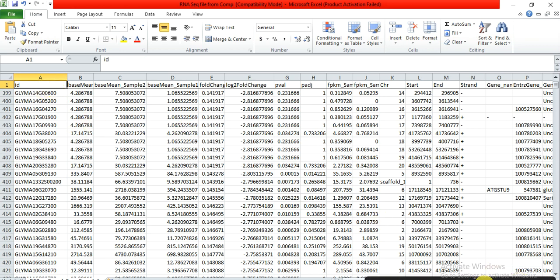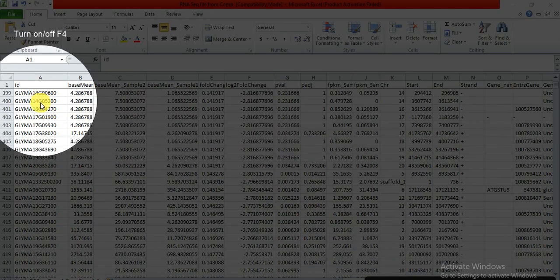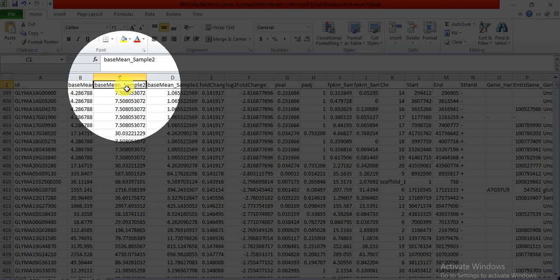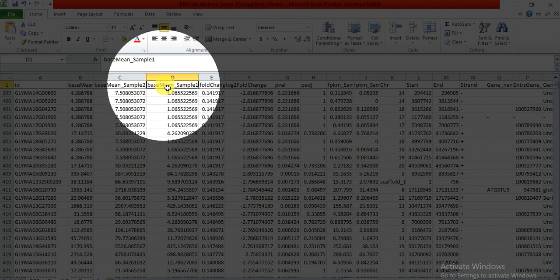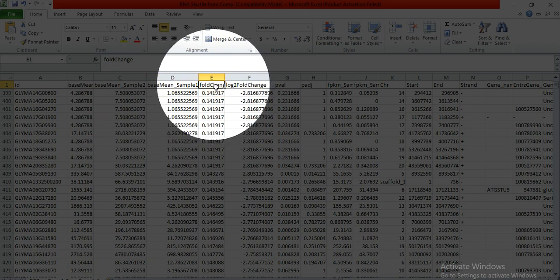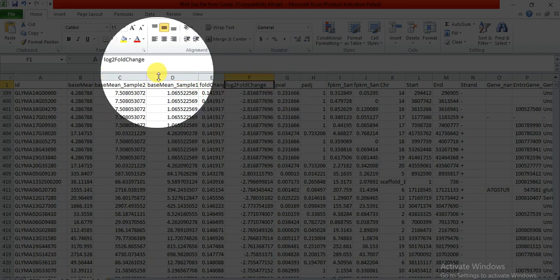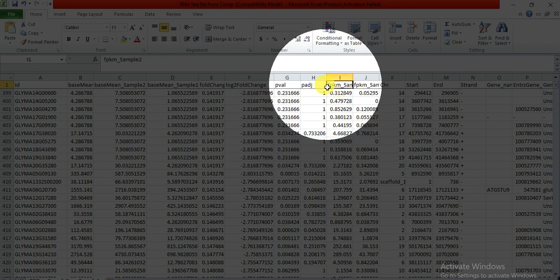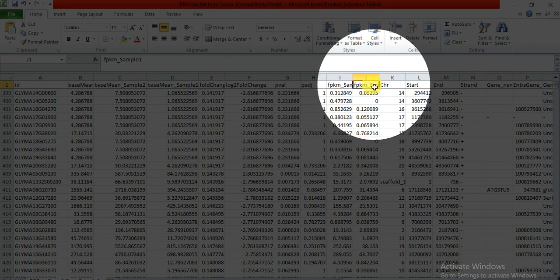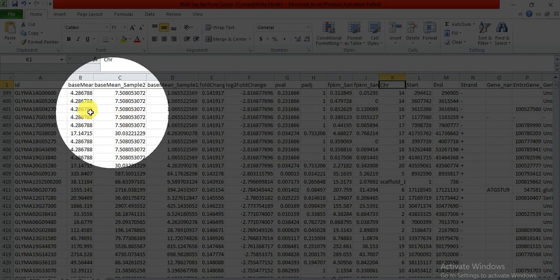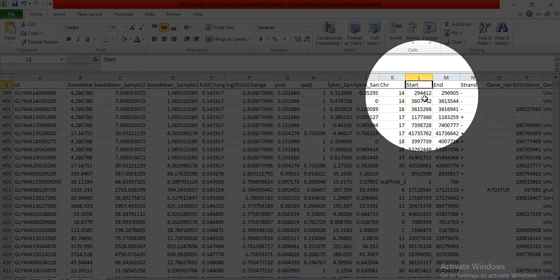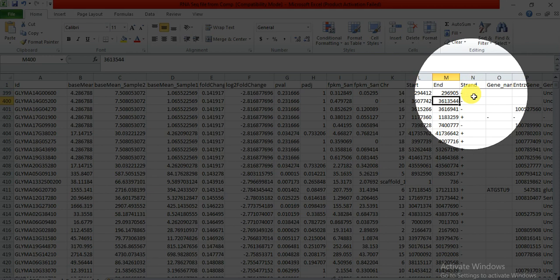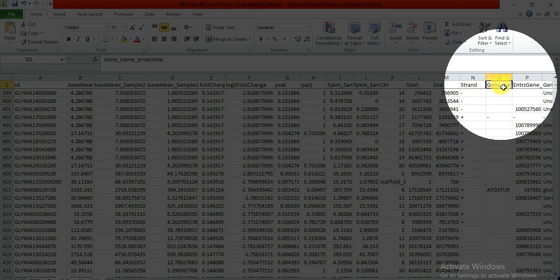The file contains gene IDs, the base mean value, base mean values for the control sample and treated sample, fold change, log2 fold change, p-value, FPKM values for sample one and control, chromosome location, gene start and end positions, strand direction (forward or reverse), and the gene name in the assembled database.